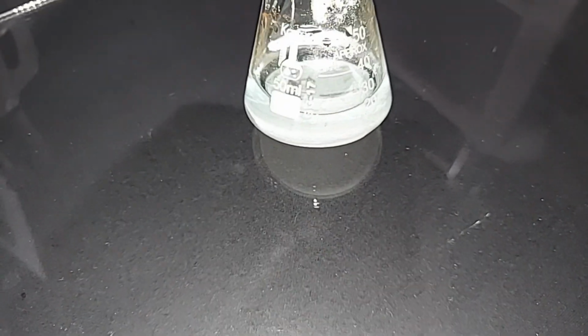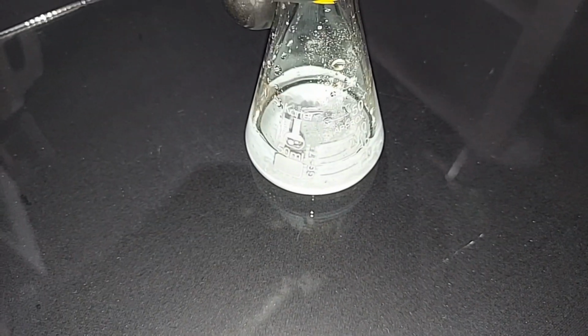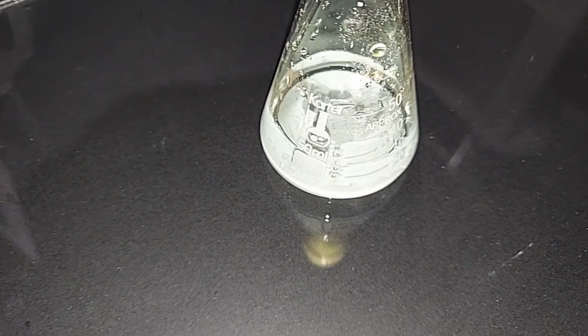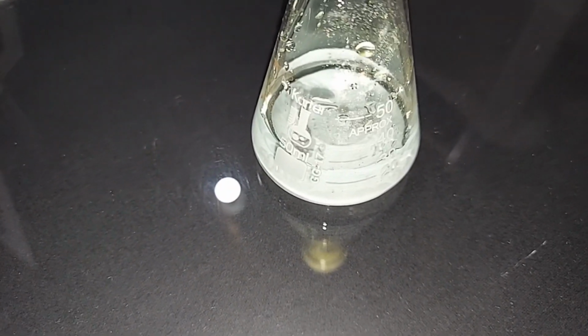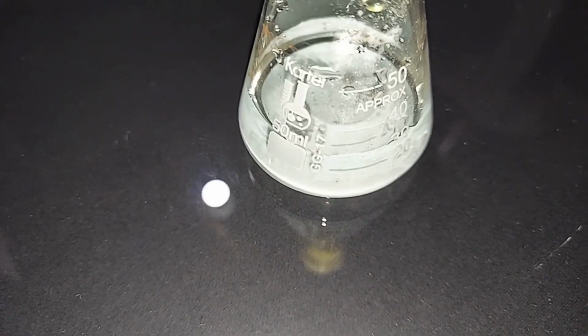So I just wanted to show you the final product here, which is this copper 1 chloride covered in water, which I'll keep. Don't forget the small amount, and it's not that small, but it came from a diluted solution and then it was diluted again. So there's quite a bit left that I could do this to, and I don't know exactly the stoichiometry of it, but I would end up with a pretty decent amount of copper 1 chloride. And again, I probably will do that on my own off camera, but I just wanted to show you the end result.